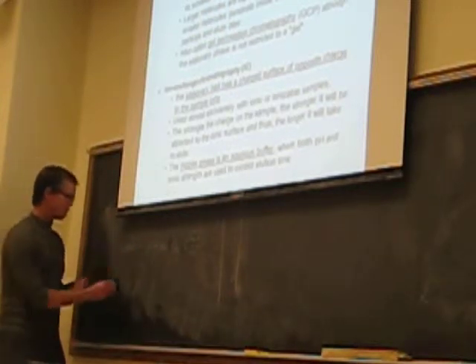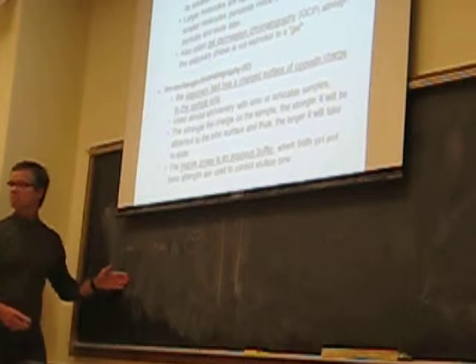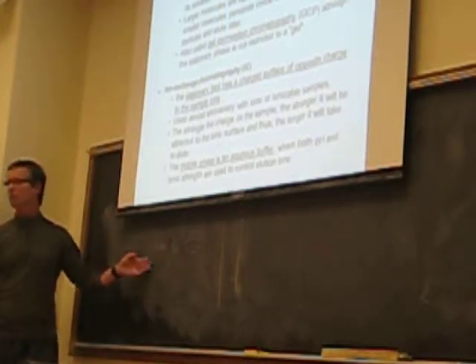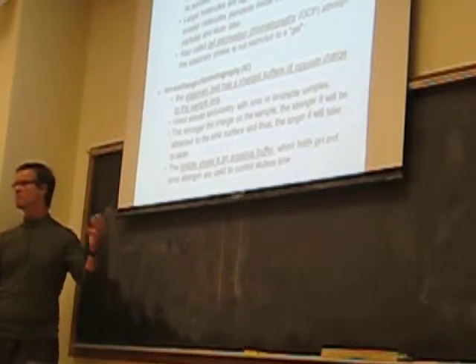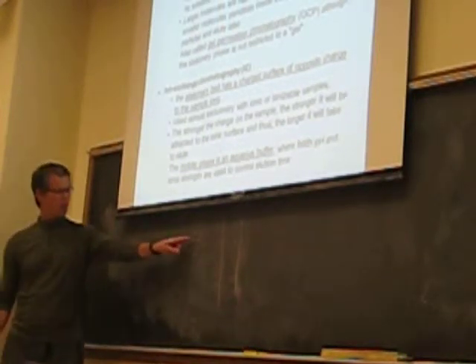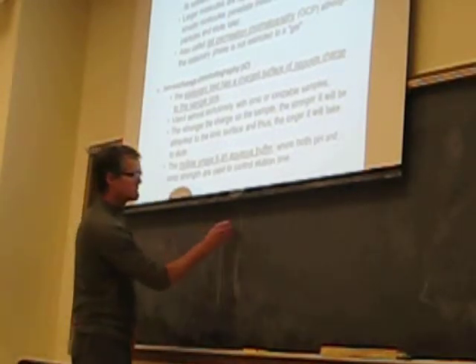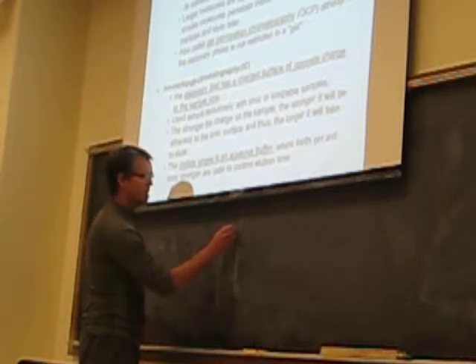And so you can have a range of maybe 2,000 to 10,000 for the mean diameter of this pore. Maybe from 10,000 to 30,000, maybe from 30,000 to 60,000, so there's different size ranges of the pore diameter, the average pore diameter in these beads that are packed in the column. And then you load your sample on, and I'll draw one that's bigger now, so you can see it.